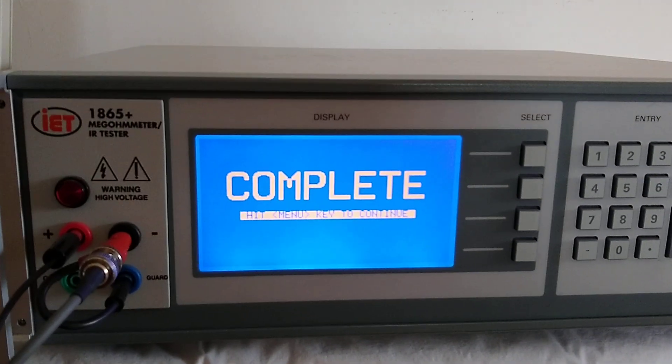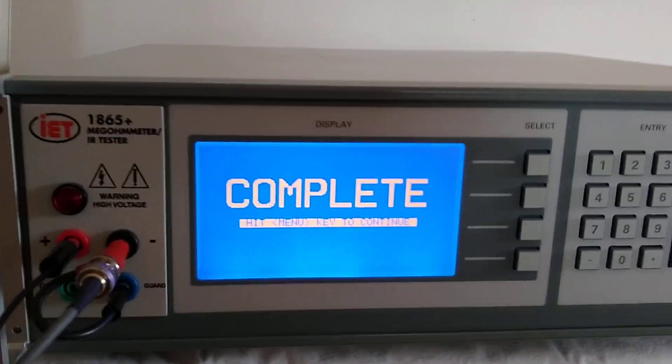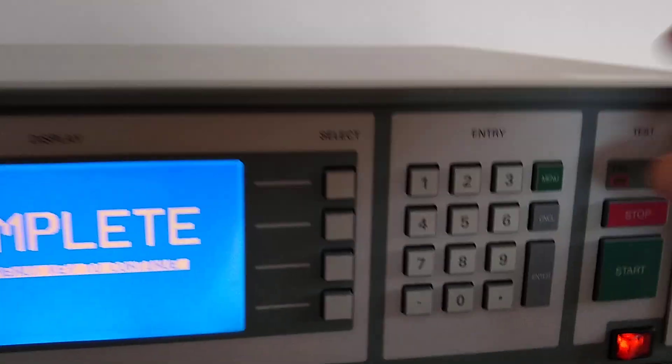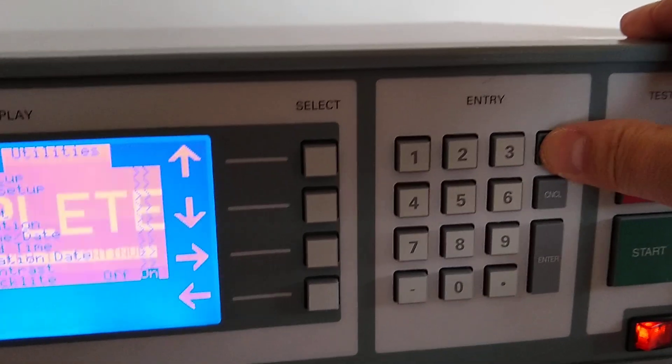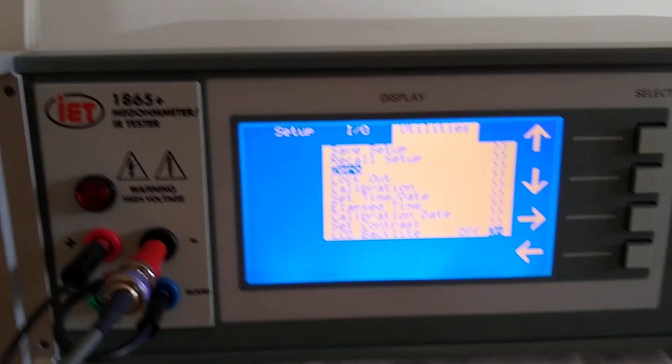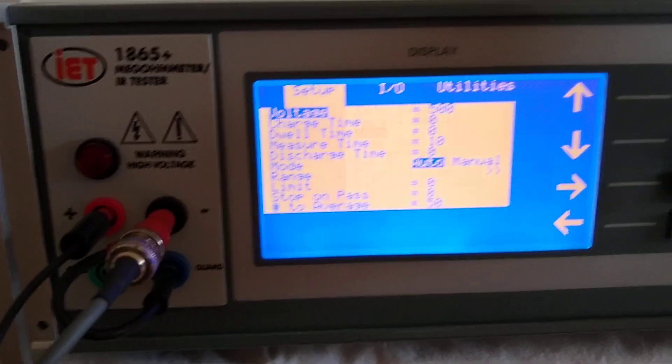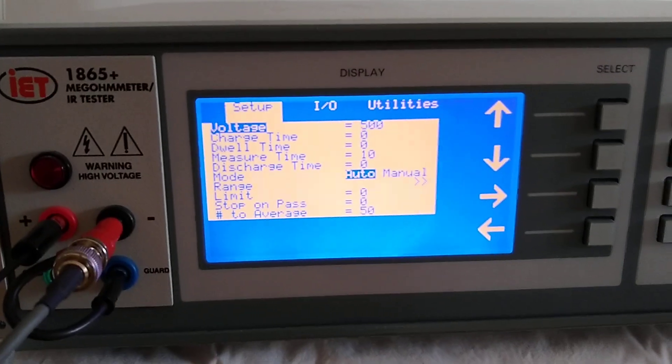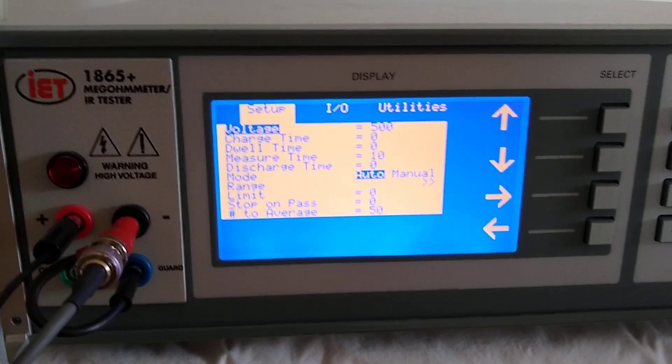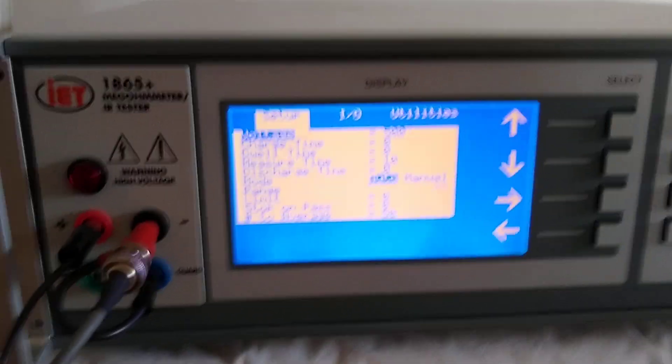Once the zero completes, it will come up with a complete screen. At this point, we will press the menu button. This will bring us back to our standard menu. We can go back over to setup just so we can see the setup. At this point, we would want to place the sample into the cell.